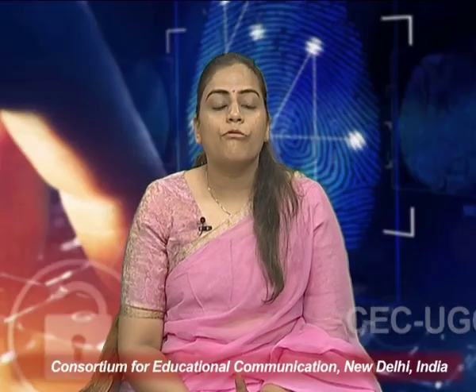FTIR is basically Fourier transform infrared spectroscopy. There are two different changes compared to FTIR and dispersive instruments. In FTIR, instead of the monochromator, we have an interferometer, and whenever we are measuring through the detector, the signal which we get is in the form of interferograms, and those interferograms are further changed into the spectra.